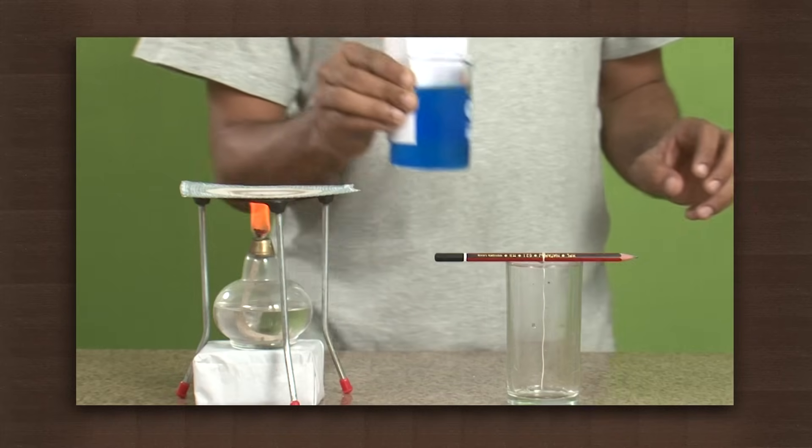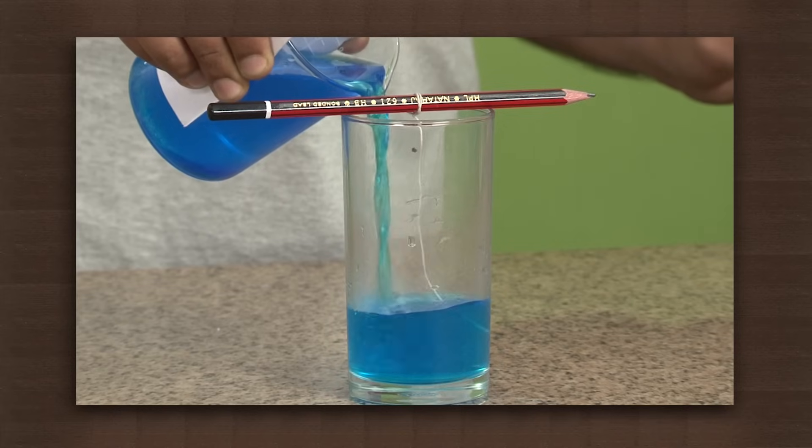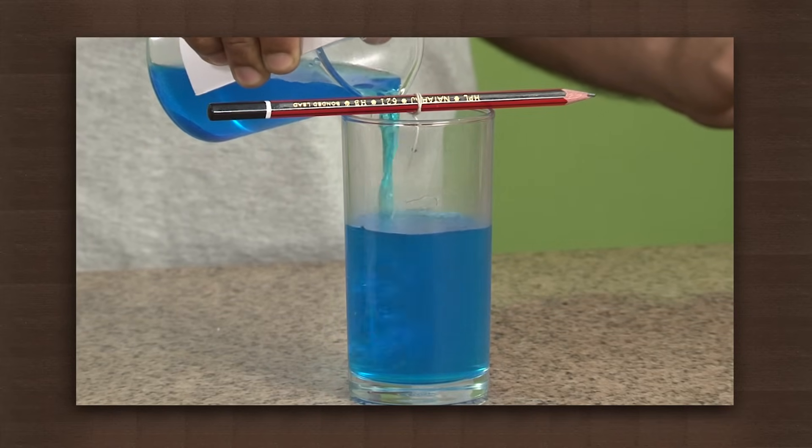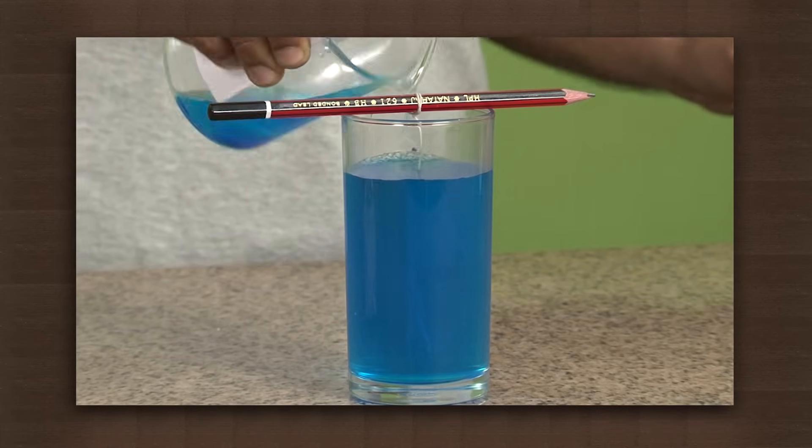Now, remove the solution from the burner. Pour the solution in the glass. Leave the glass aside for a few days.